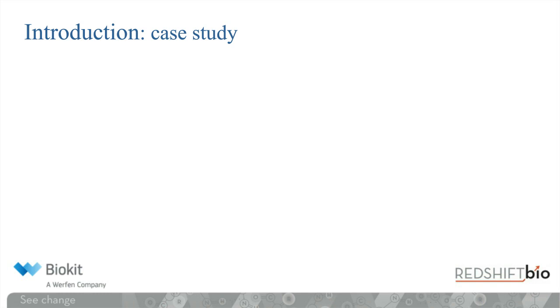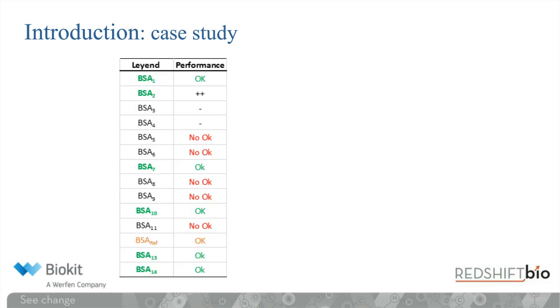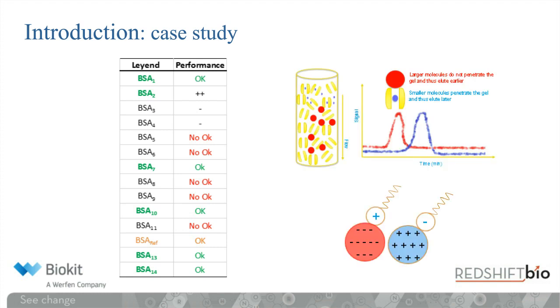Now, for our case study, for a specific reagent, several lots of BSA from different vendors were purchased and characterized in order to know if we could predict its performance. Therefore, analytical characterization of this raw material started in order to understand if there were any structural changes or traits able to explain why some BSA samples worked and some did not.